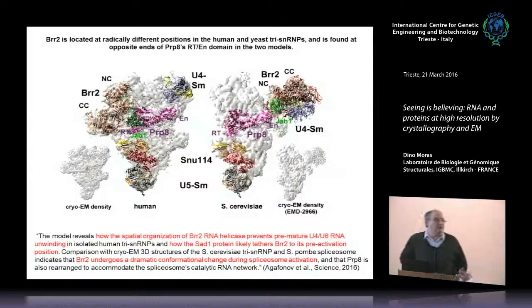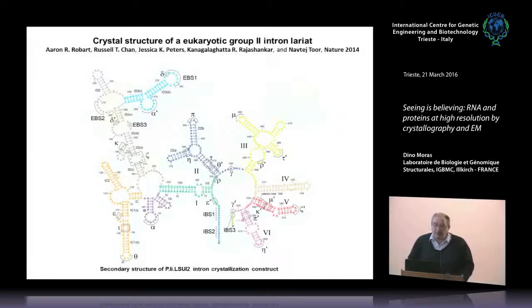You see there are differences. So now it becomes even more interesting when you compare things. You will see Mark will tell you more about the ribosome things when you compare bacteria and eukaryotes. But here human and yeast, they are both eukaryotes, but very different. And so we are entering that region.